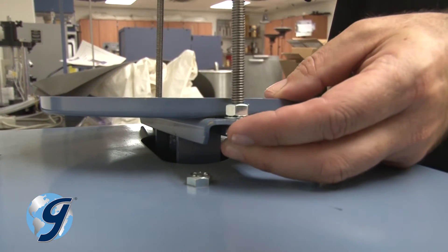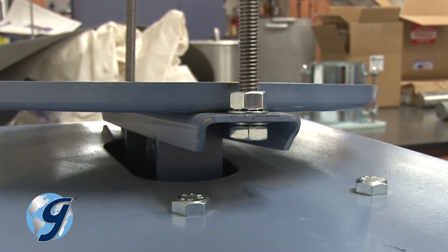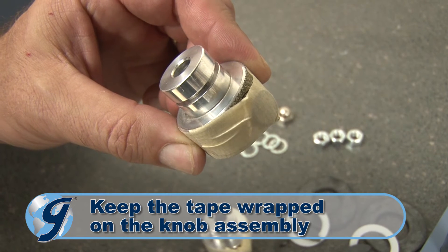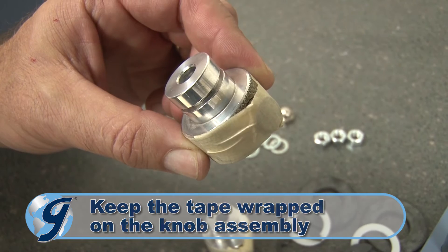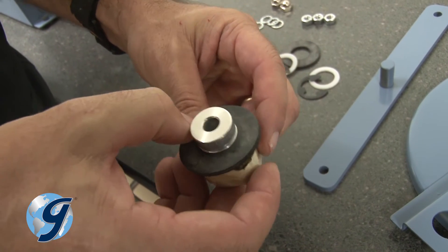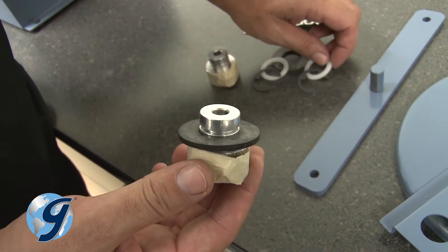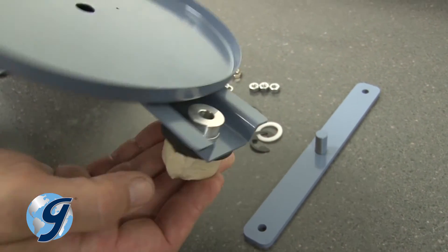Now we're going to assemble the Easy Clamp knobs to the sieve cover assembly. First, keep the tape wrapped around the knob assembly to hold the button and spring in place. Next, push the black Easy Clamp rubber washer onto the underside of the Easy Clamp knob assembly. Place the Easy Clamp knob through the large hole on the sieve cover.